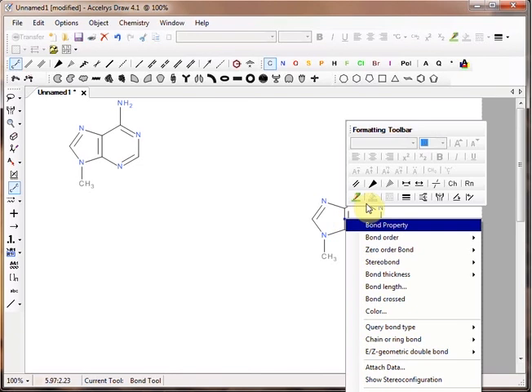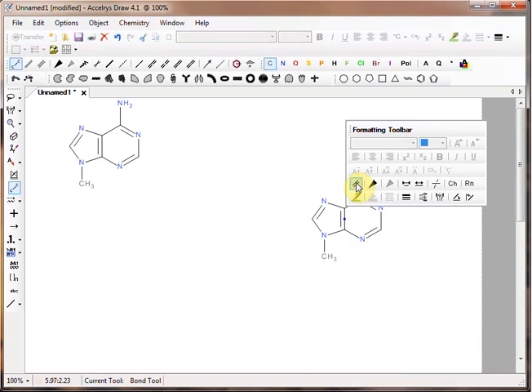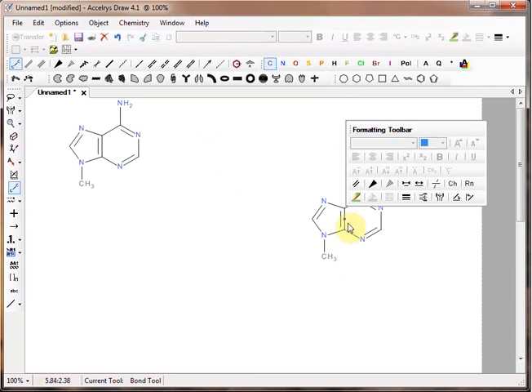This button is the one that we need, and we can change how that bond appears. It cycles through the three display options for that double bond, and then we've quite quickly got to the structure that you started off by drawing.